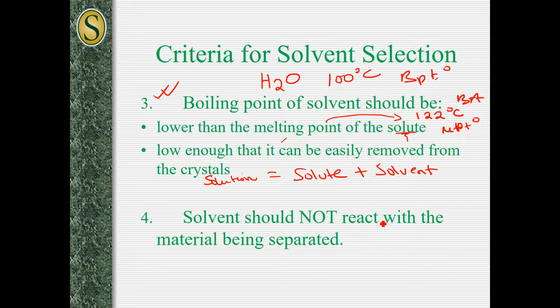Okay, the solvent should not react with the material to be separated. That's another criteria. In other words, the solvent must be inert. It should not change the chemical property of the sample being purified.